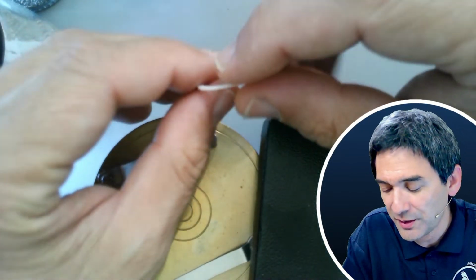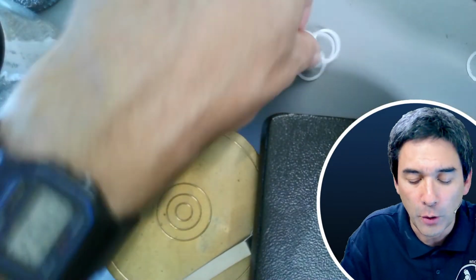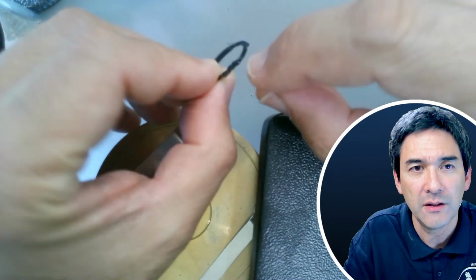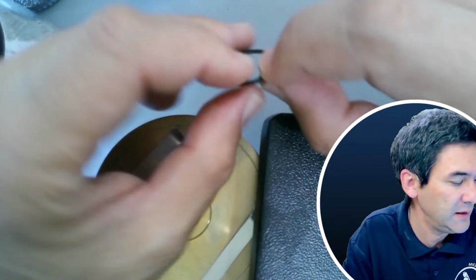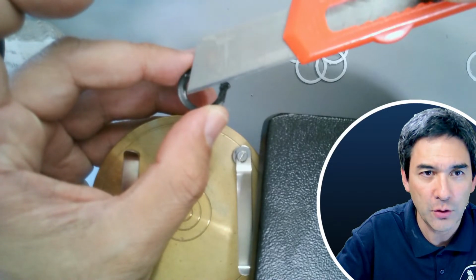The problem with some of those was that while the bottom surface is very smooth, the top surface wasn't very smooth. Maybe you can see it over here, right? So maybe my 3D printer is not properly adjusted. What I did is I took a sharp knife and scratched off the surface.